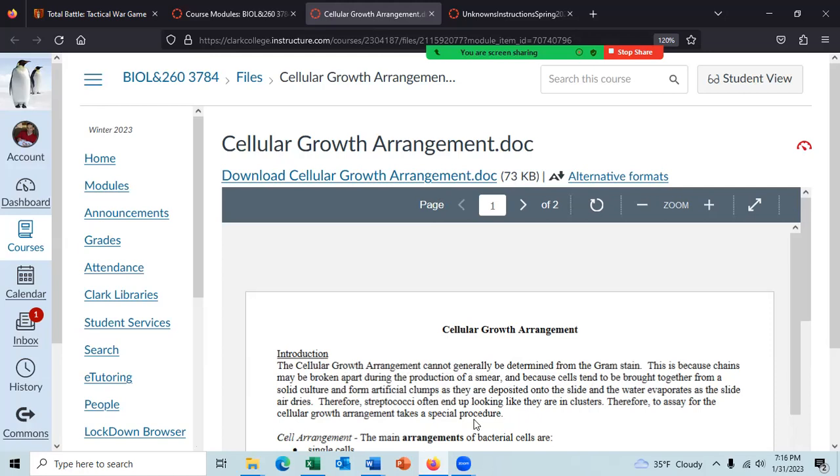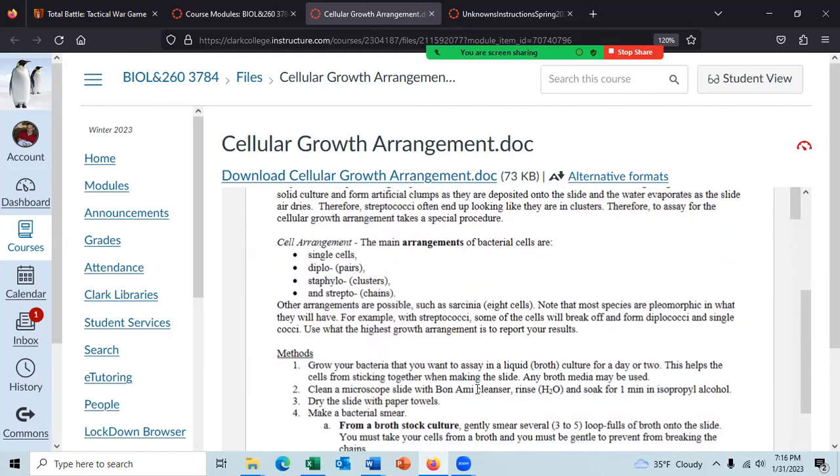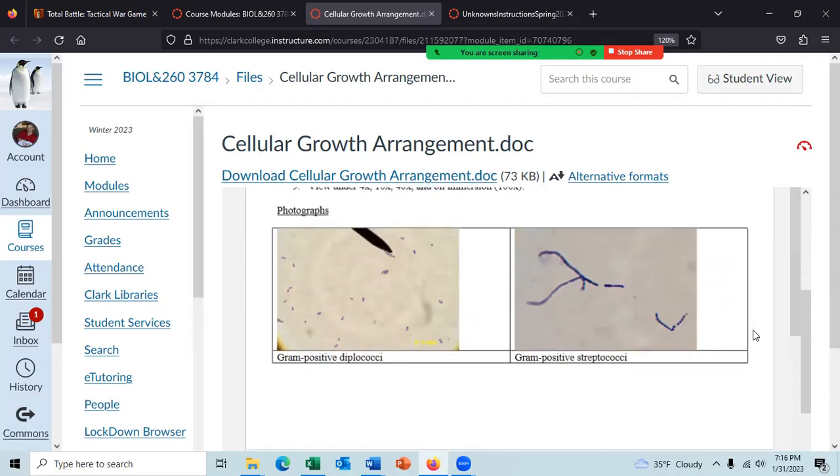To assay for this, you take a special procedure: grow your bacteria in a liquid culture, and then take a loop of the liquid culture, put it on a slide, and then very gently stain the cells. Okay? So that you don't disturb the cellular growth arrangement. And then you look at the cells.